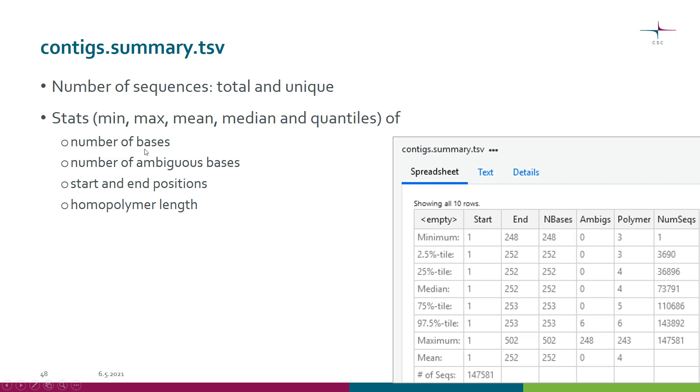Number of bases, for example. We can see that the shortest contig was 248 bases long, which sort of rings a bell that something might be wrong there.